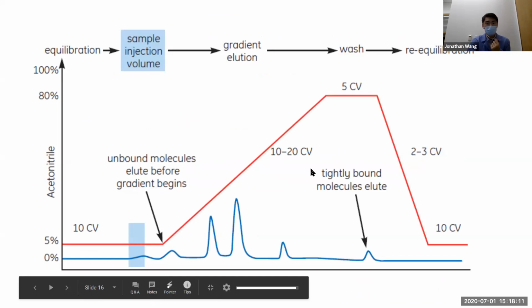Finally, you can see the overall flow of organic solvent over time in this graph. This is what's known as a chromatogram as well.